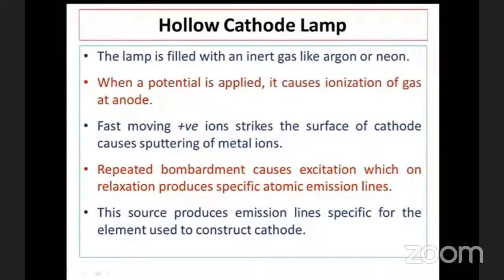These metal atoms now collide with the highly energetic gas ions and get excited. These excited metal atoms emit their characteristic radiation, which usually consists of a small number of individual wavelengths. This emitted radiation appears as a bright glow in the hollow cathode cup.